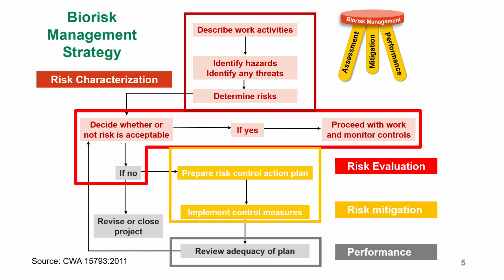That way, you've reduced the chances of you getting exposed to Ebola through culture, because in the sample, most of the time, the concentrations will be less as compared to a culture. Therefore, at this particular point, your entire procedure will change, and almost all your mitigations will change. You may not need a biosafety class 3 type of facility. You may not need all these extra features. All you're doing is receiving a sample. You get part of the sample, you put it on a testing strip, and that's it, because that's what your facility is able to handle.